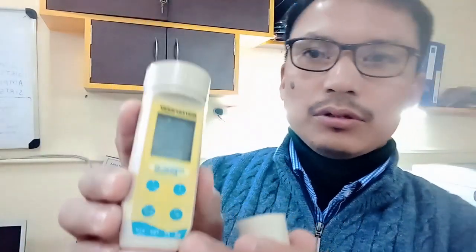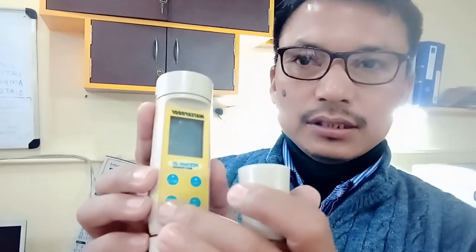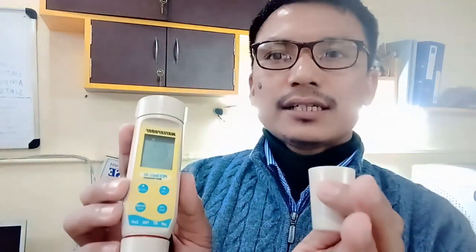Similarly, if you go for electrical conductivity, you know most of the ions give electrons, and that will give the electrical conductivity. So electrical conductivity, in other words, shows the saline salt quantity of the water. This electrical conductivity can be measured from this probe by changing the button to EC, and you will get the total ions in the water.